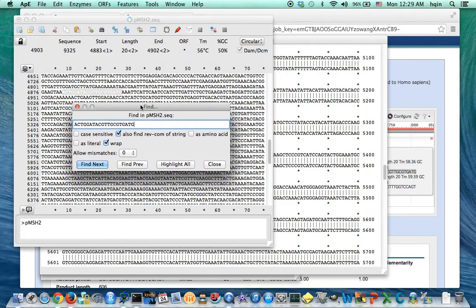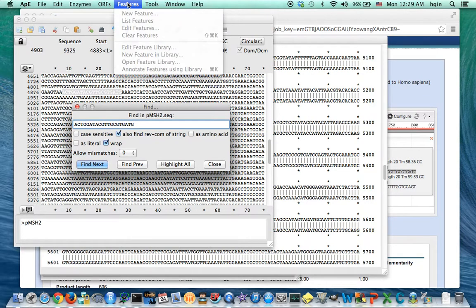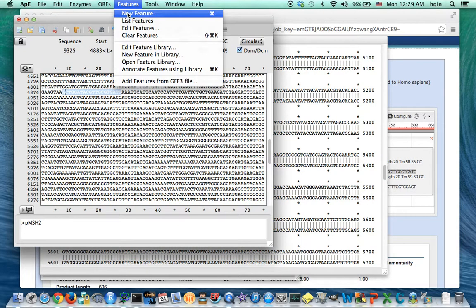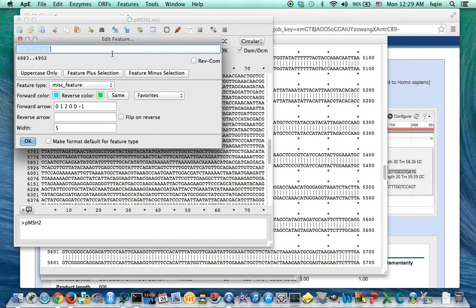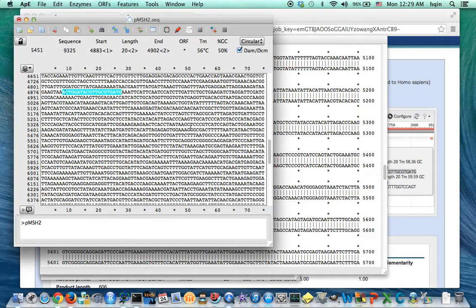It's found about 4876, 7, 4880 something. Then I close, go to feature, new feature. So this will be my forward primer.